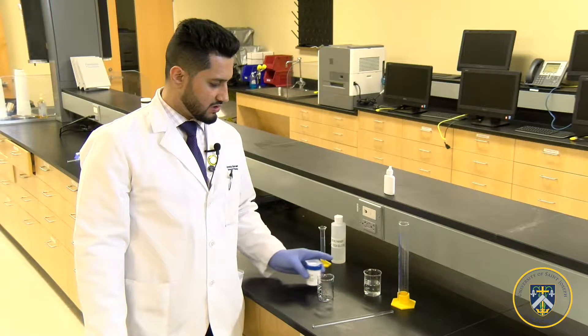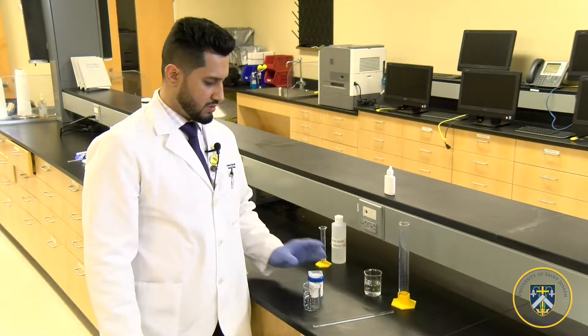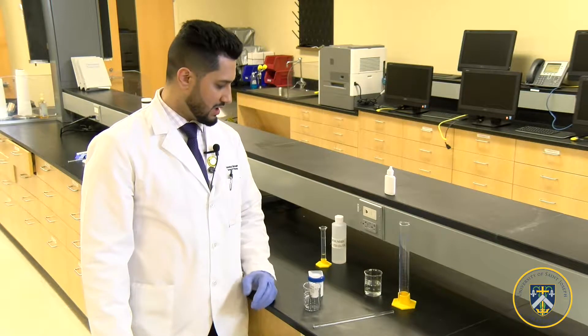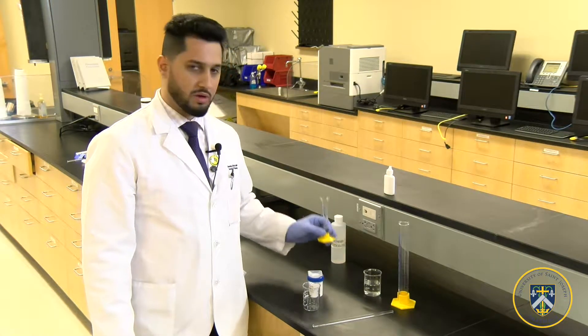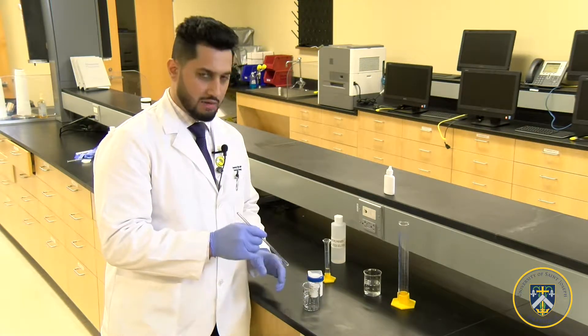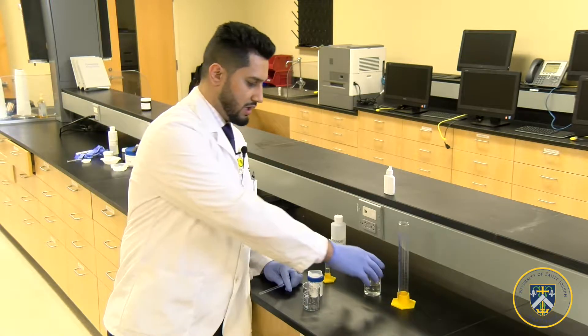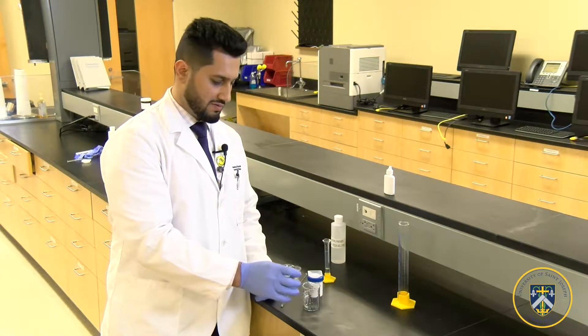I've already weighed the amount of sodium chloride that's necessary for our amount of water that we're going to be adding, which is 30 mLs, and the amount of methylparaben that we're going to be adding. So to make this easy, we can put it on a hot plate, which will help the dissolvement of sodium chloride in water, making it faster.